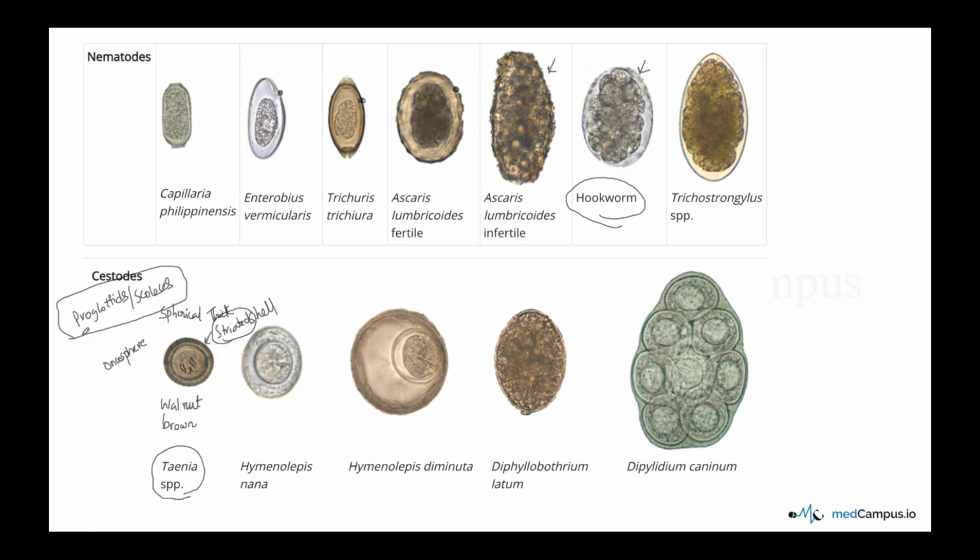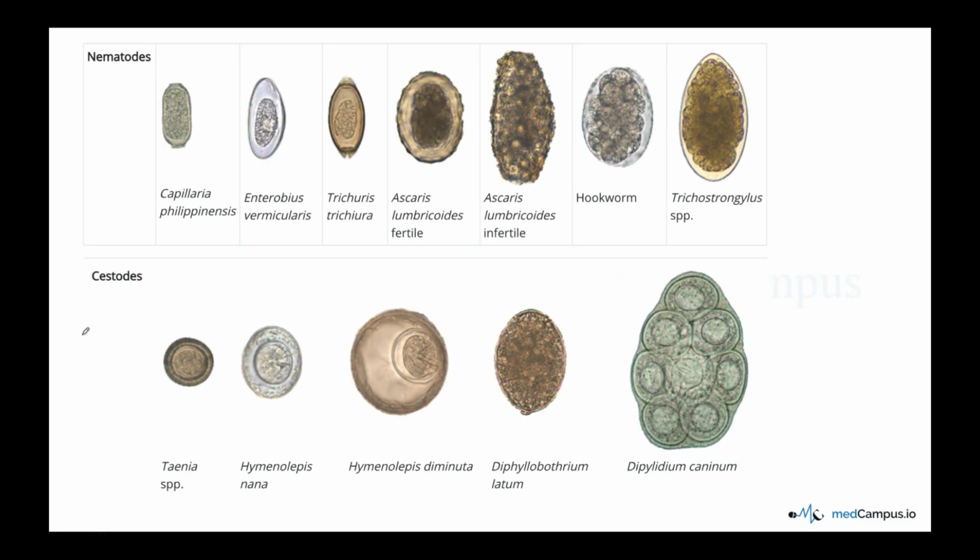So you have to only report it as Taenia species, similar to the hookworm. This is your take-home concept. I think this much is more than enough for you when it comes to identification of the eggs. Beyond this, not many questions are asked, but I'm continuing this topic so that we'll cover everything with regards to the eggs in parasitology.